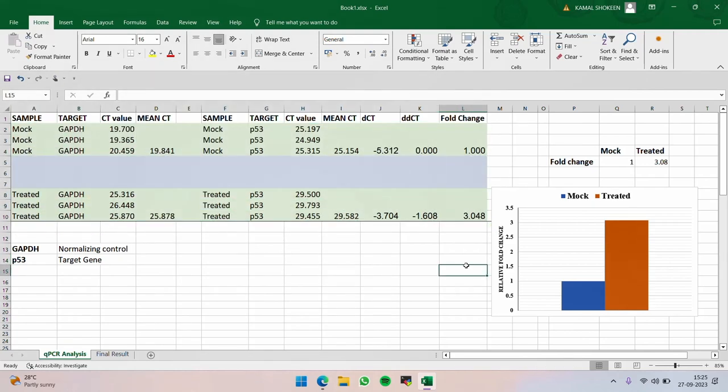Now as sir mentioned earlier, we generally prefer the real-time machine for the detection method. If you can recall, you went to a doctor and got a real-time PCR to see if you are COVID positive or not. So what he or she did, they took your samples from your cheeks, then did the real-time PCR, and at the end they got the Ct value. The Ct value ranges from 1 to 40, because we are running the reaction for 40 cycles.